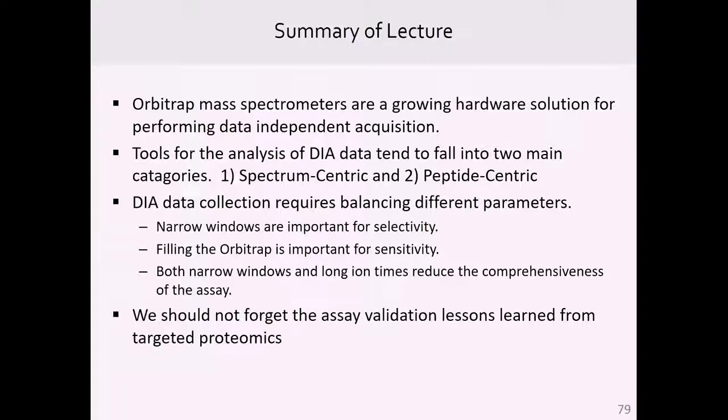Part of the reason for the short time scale is that the clinical labs don't want to do overnight digestions. They would rather do a 1 to 2 hour digestion and then run samples and get data back to the patients. Because we have a couple of assays in the lab which we are thinking about moving over to the hospital clinical lab, that forced us to think about things as a fairly quick turnover. But we wanted to make sure the peptides that we were using were at least stabilized at the time point we were using. But that's a good observation.